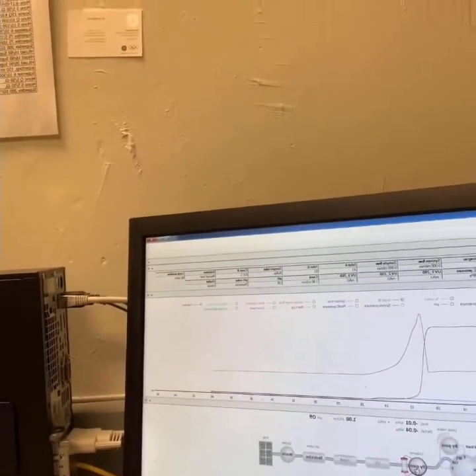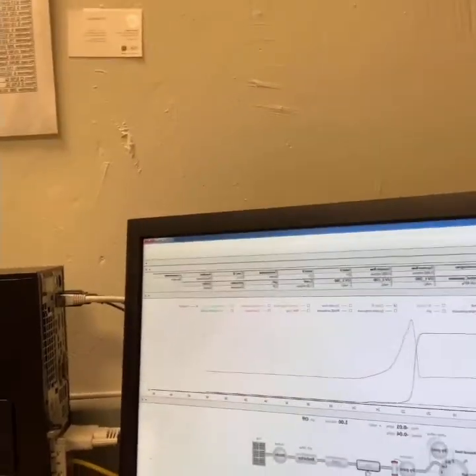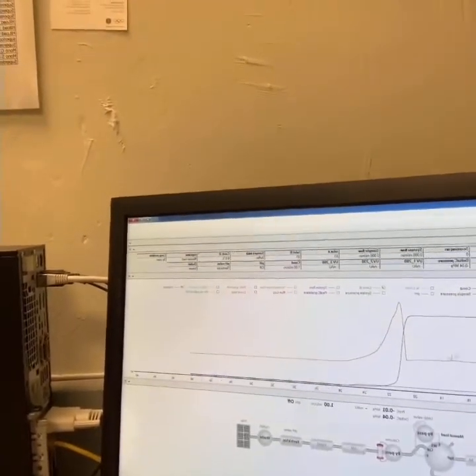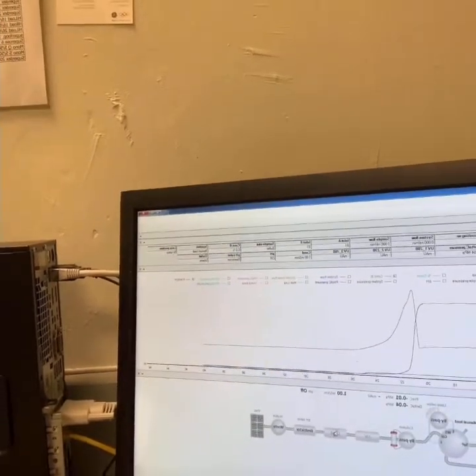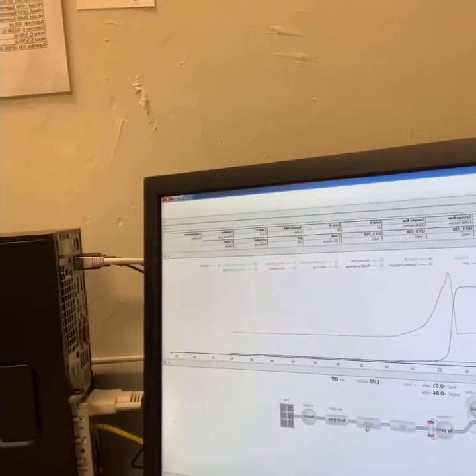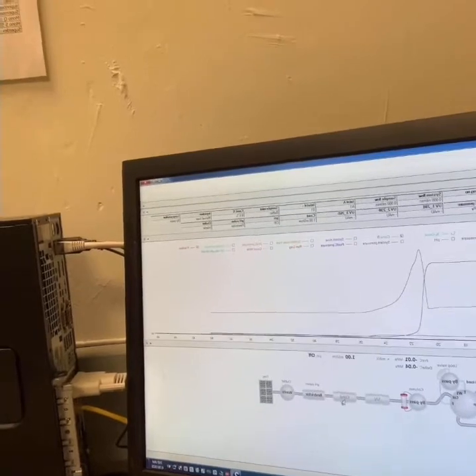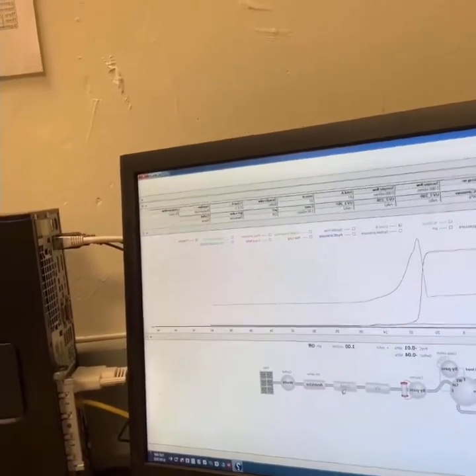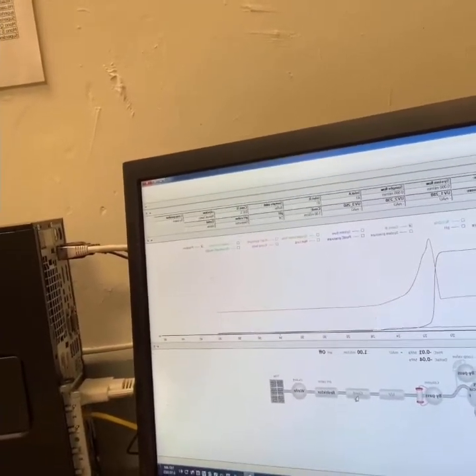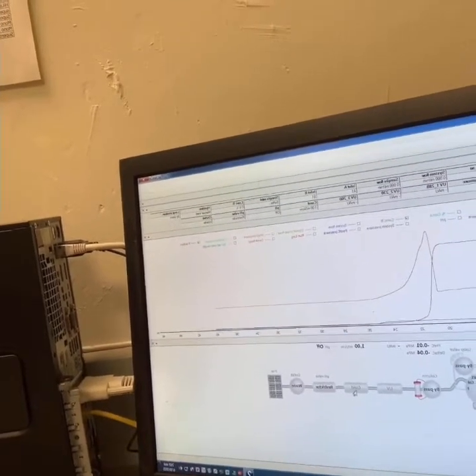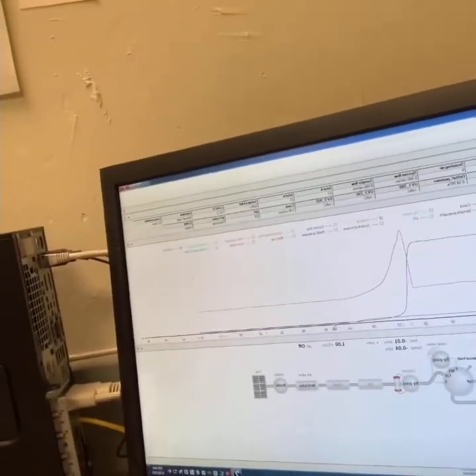So you can have a loop, you can hold your sample in this loop until you're ready for it to inject onto the column. Then you choose what column you want. So there's different column positions and then you can choose if you want it to flow up or down. And then it's going to go through a UV monitor. So that's going to be where we get our chromatograph stuff. So that's going to see where the protein comes out. A conductivity meter is so the conductivity largely reflects the buffer, how much salt and stuff is in the buffer. But it's good for seeing if your column is equilibrated because if you change the buffer to equilibrate it, so get the column all filled with the new buffer, then you want to make sure that the conductivity stabilizes at the new point.